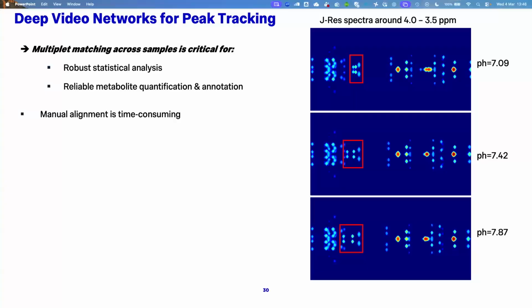What we're looking for is which peaks, which metabolites have gone up or down in concentration. So we would really like to take out this positional variation as much as possible, or at the very least match the peaks between these different samples so that we can say, yes, these two peaks are the same ones in each one, and maybe these ones are the same as those ones there. So there's a peak tracking problem that we have to address. These are simulated data, which are obviously relatively simple. When you look at real data, it becomes even more tricky.